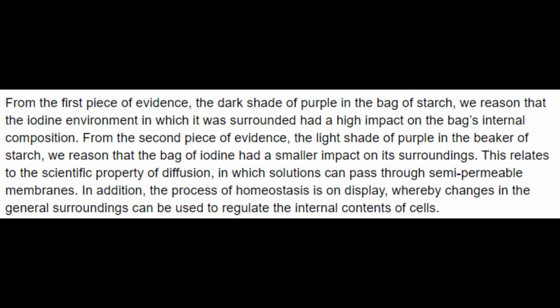From the first piece of evidence, the dark shade of purple in the bag of starch, we reasoned that the iodine environment in which it was surrounded had a high impact on the bag's internal composition. From the second piece of evidence, the light shade of purple on the beaker of starch, we reasoned that the bag of iodine had a smaller impact on its surroundings.